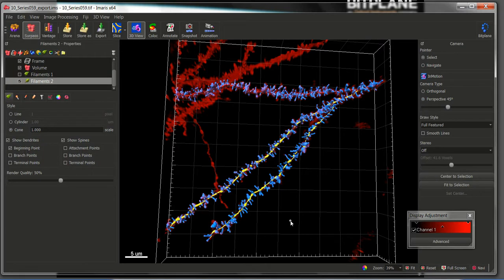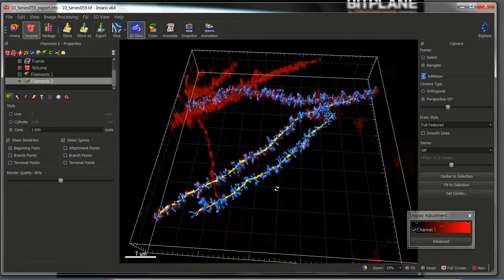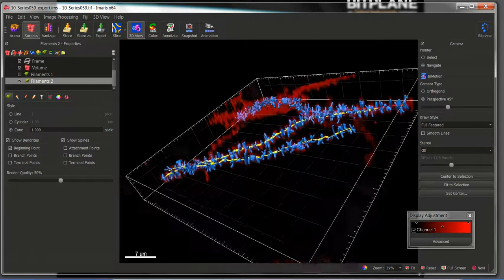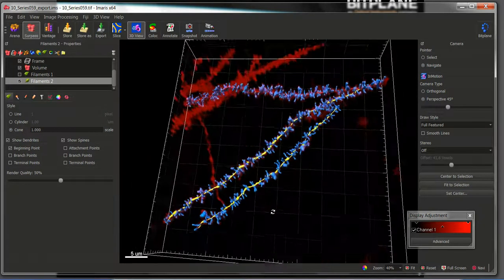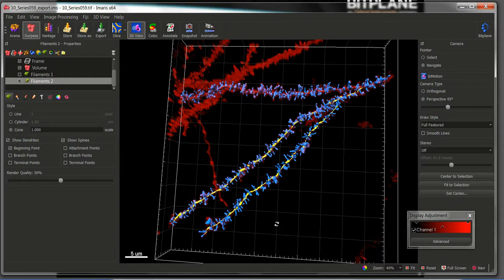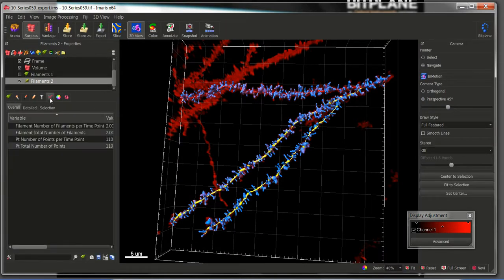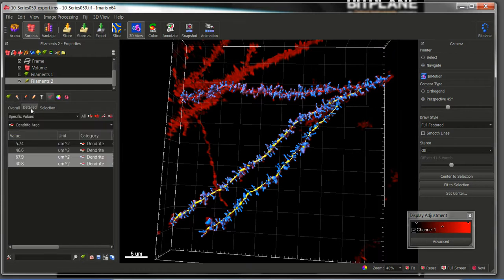And now we have the dendrites segmented with the corresponding spines. All the statistics can be found in the statistics tab under overall and detail.